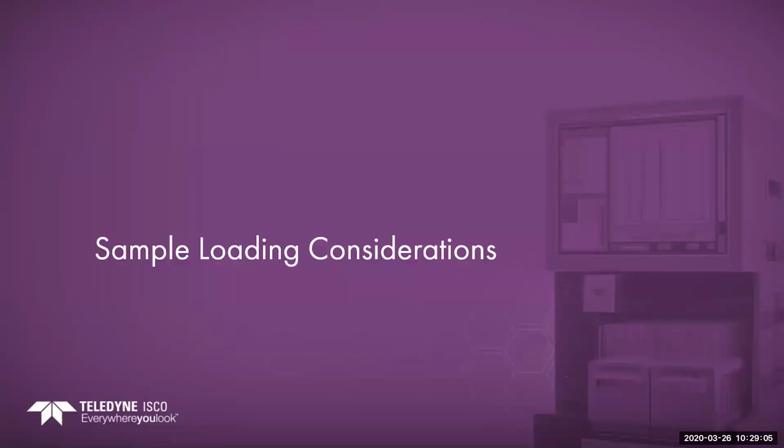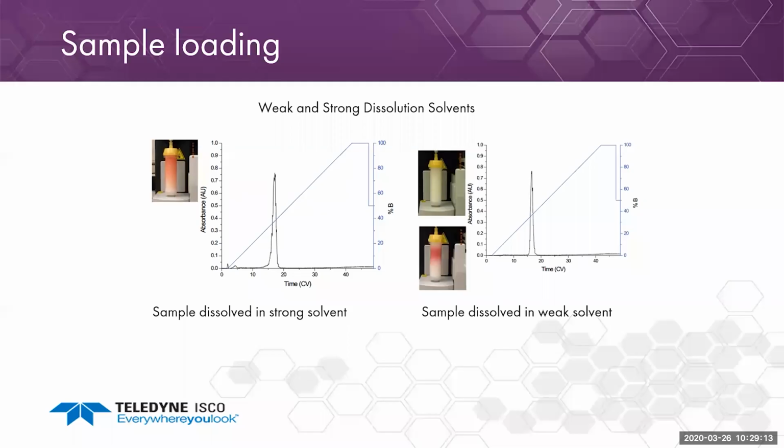Moving down, sample loading consideration. I see a question over here, and I'll pick up these questions at the end of the webinar. Some sample loading considerations: weak and strong dissolution solvents.